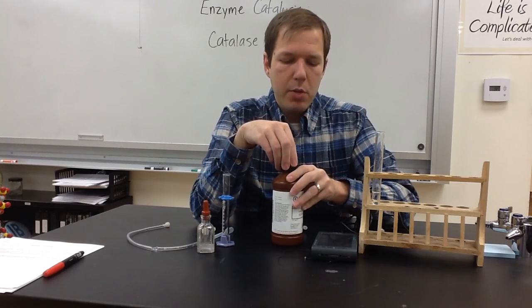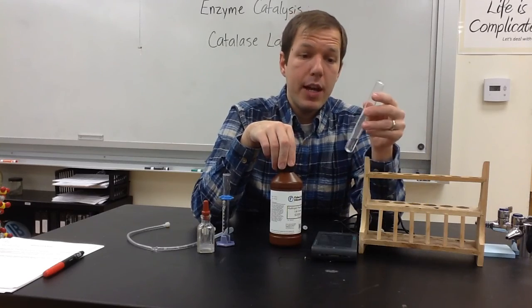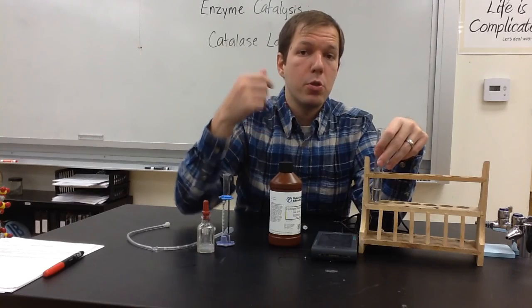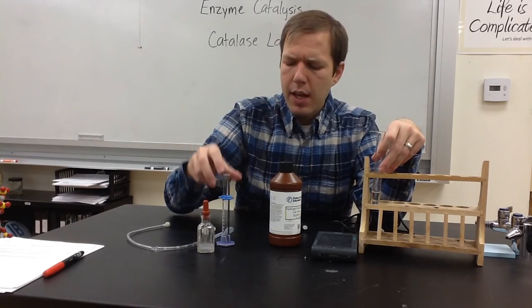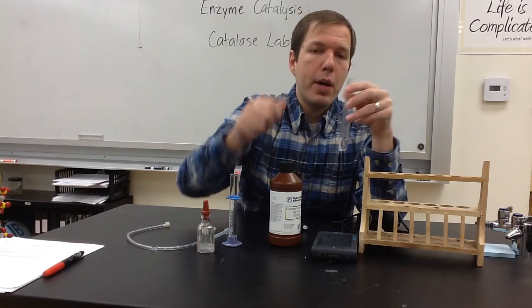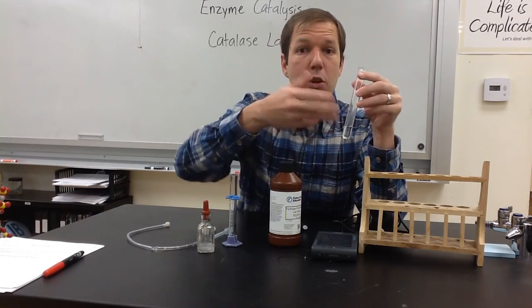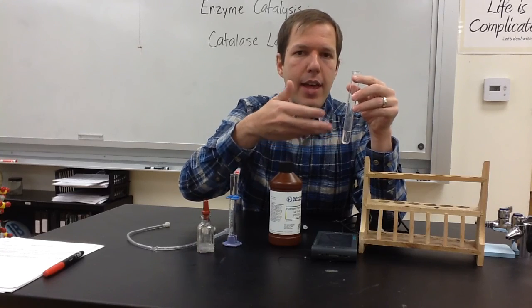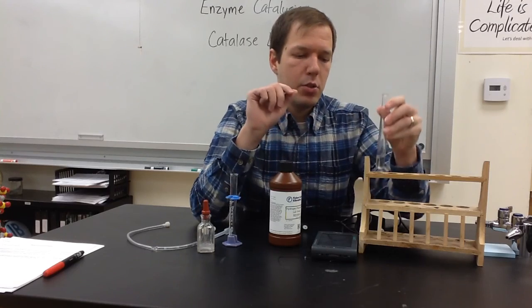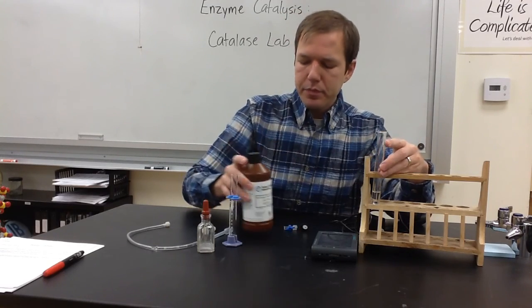So in terms of how this corresponds to your lab, it would not be a good idea to pour the peroxide into 10 different test tubes and use those test tubes over several different days. Even though it might be efficient to measure all of this out at one time, you only want to measure out the peroxide as you're using it, because as it sits here, it's going to bubble a little bit. And then you're affecting the starting concentration of peroxide in your test tubes. So avoid that, pour the peroxide as needed.